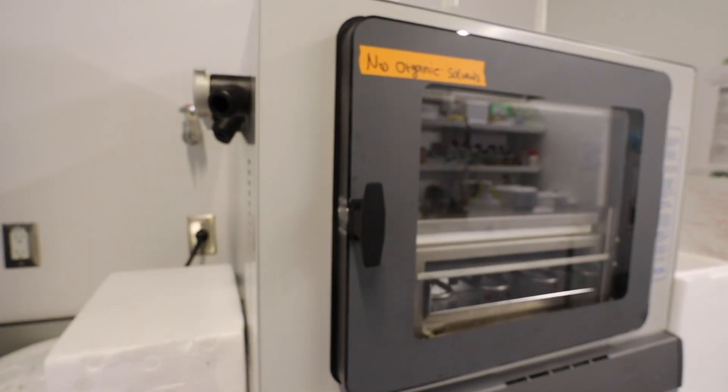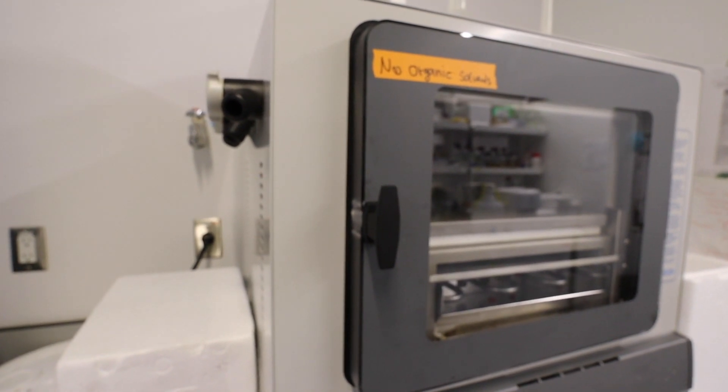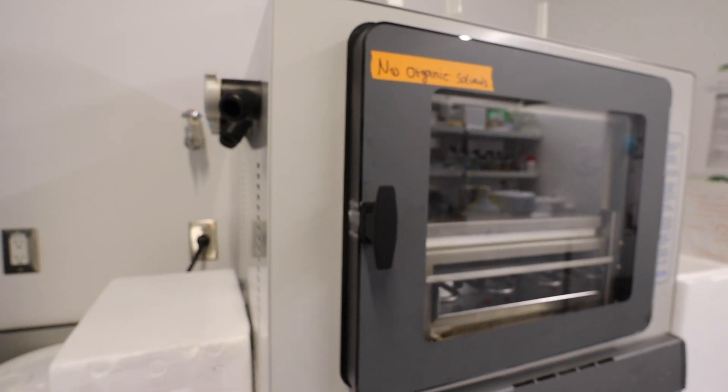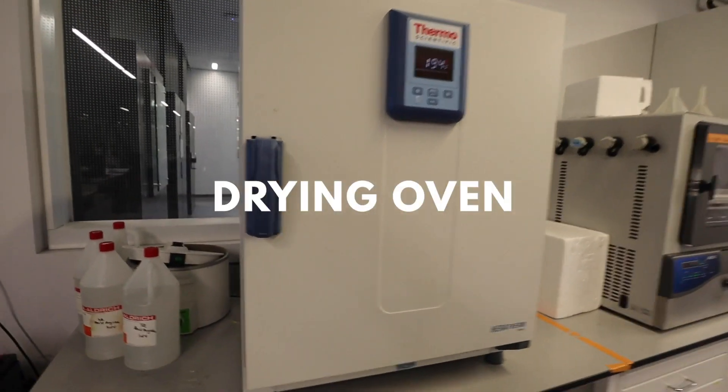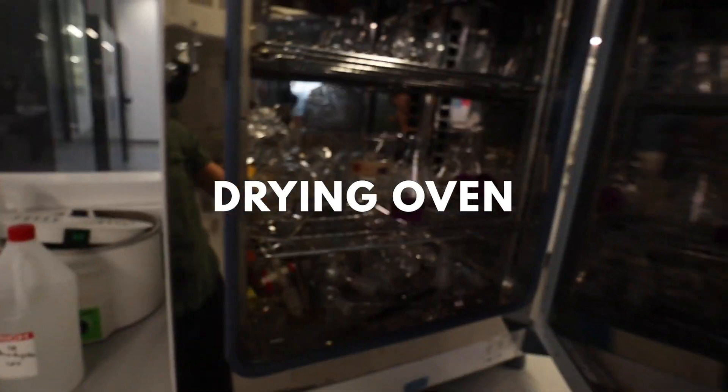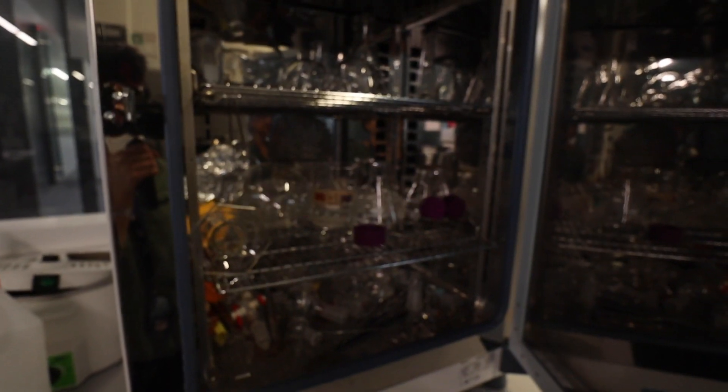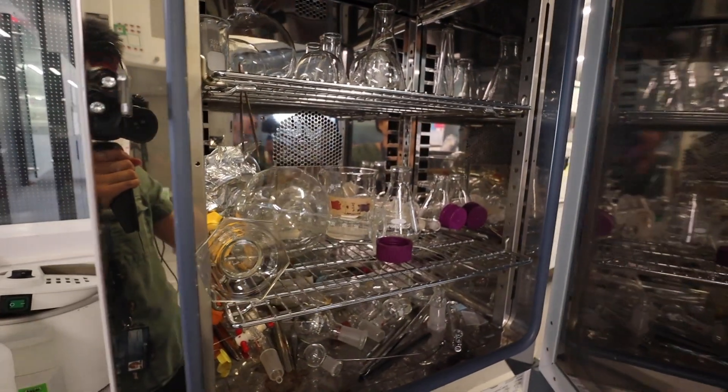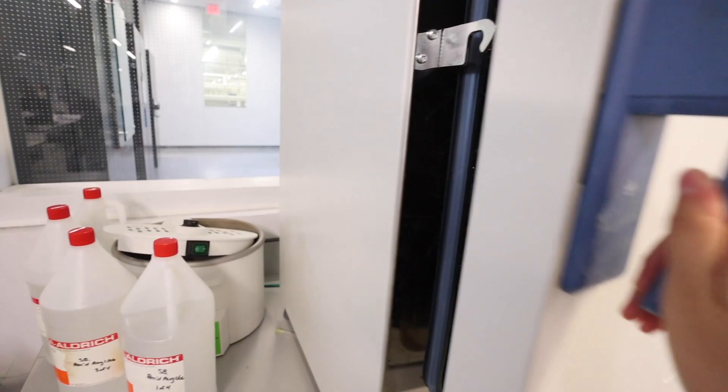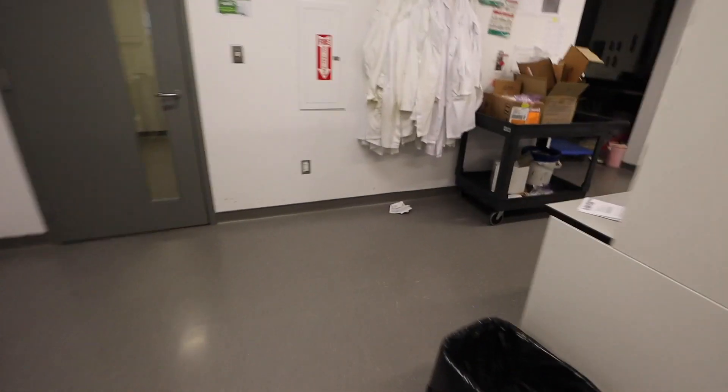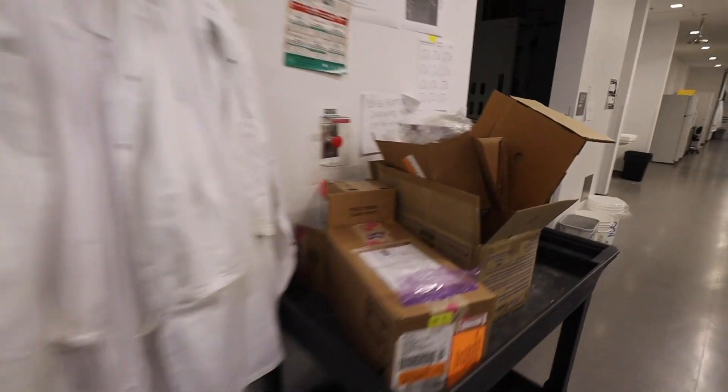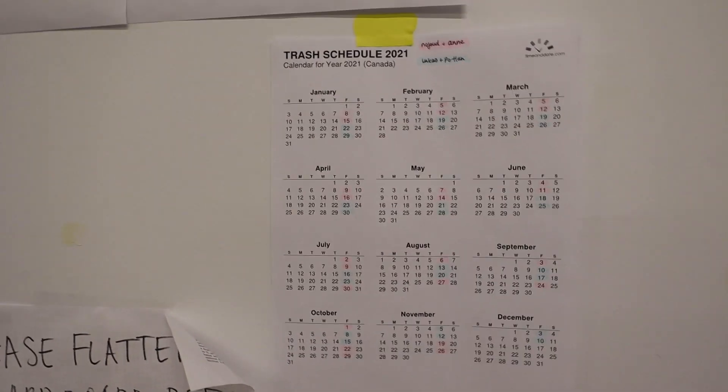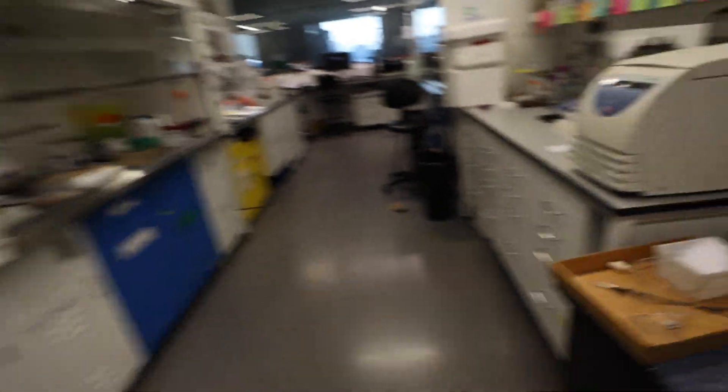This is just the oven so this is where we put our glassware to heat and dry. Nothing interesting here. Now let's walk back this way. This is our trash. Our schedule to take down stuff is here. We do have a location system.